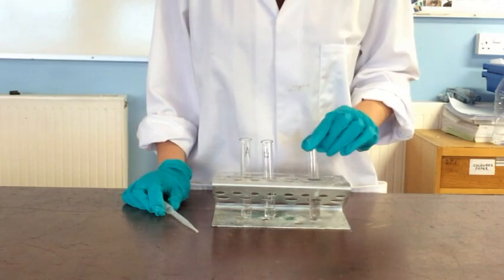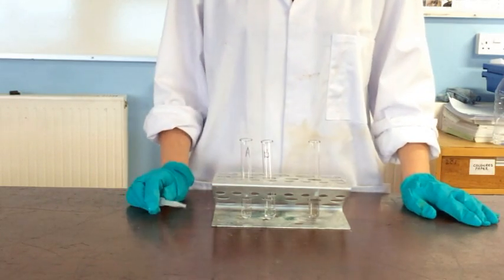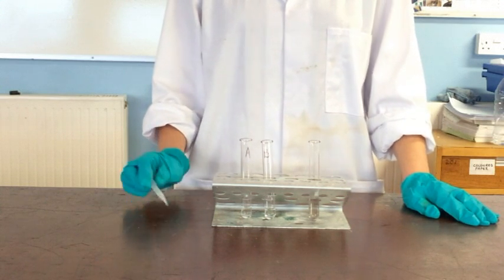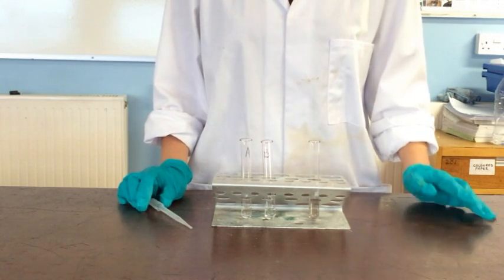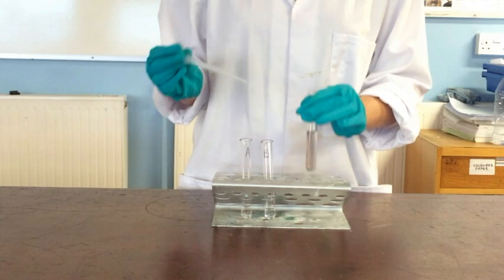Now we're going to add our Tollens' reagent to A and B and what we're looking for is if it's an aldehyde, we're going to see a silver mirror effect.